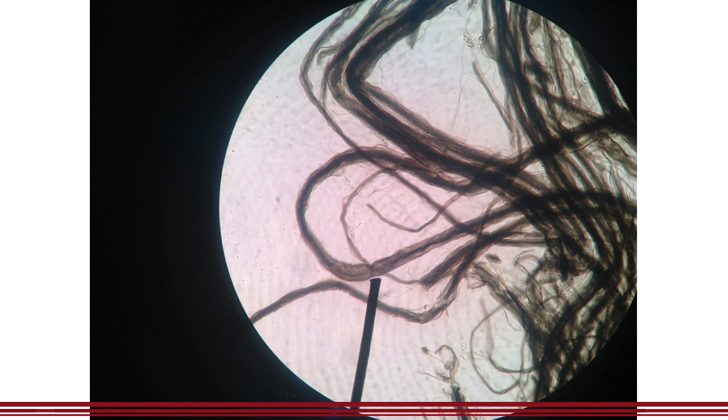So here we have again a segment of a nerve fiber. Here you have the axon or the dendrite. You have the nerve fiber here, the dark structure in the middle, and you have the myelin sheath, which is the dark gray substance surrounding the nerve fiber. Now, in regular intervals, we see these gaps, like this one here, this one here, this one here, and this is known as the nodes of Ranvier.